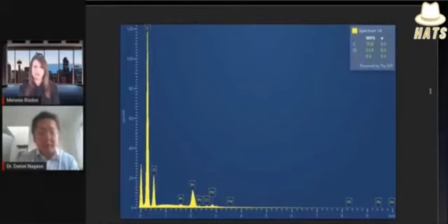The Pt are those peaks that come up when there's platinum in the sample, right? And that's platinum we added to the sample so that it doesn't burn up when exposed to a strong electron beam. Pd is palladium, and Cl, there's a little bit of chloride, which we would expect to see in anything that used to be in a salt solution.